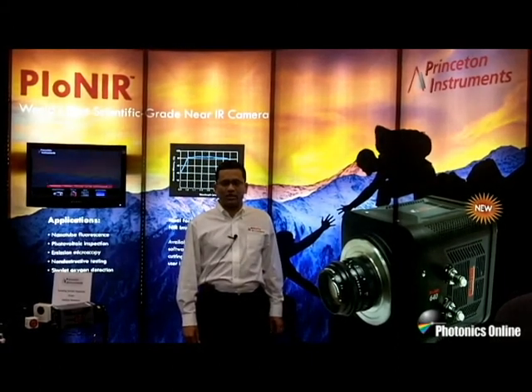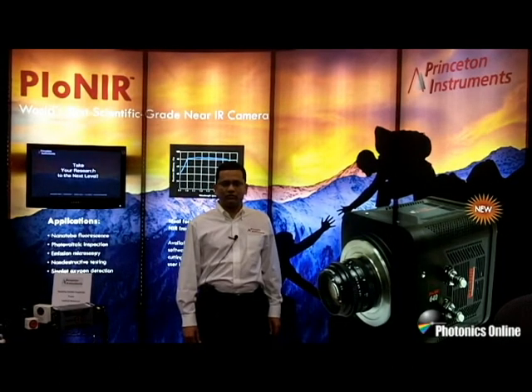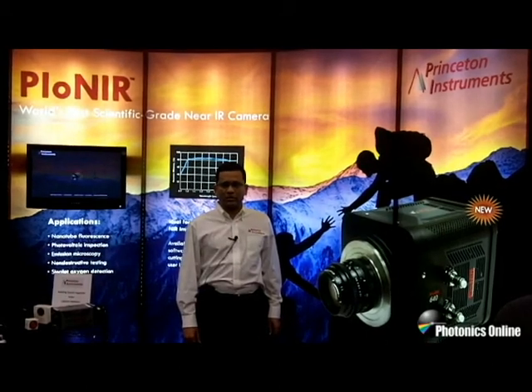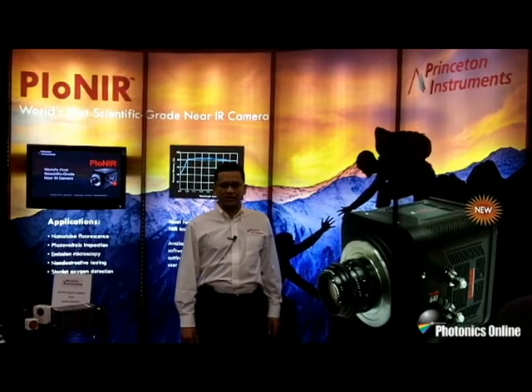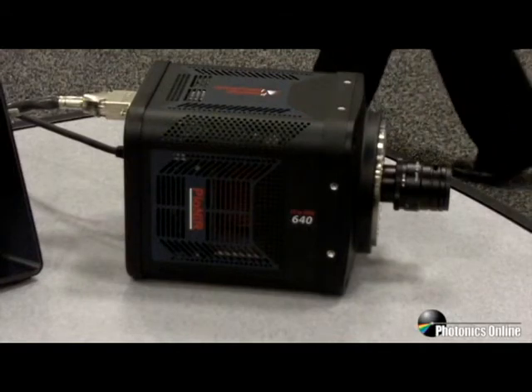Today, we are launching Pioneer, a deep-cooled InGaAs focal plane array detector at the 2012 SPIE Photonics West Conference. Pioneer is a 640x512 indium gallium arsenide, or commonly known as InGaAs focal plane array detector, cooled down to minus 90 degrees Celsius using thermoelectric cooling technology.